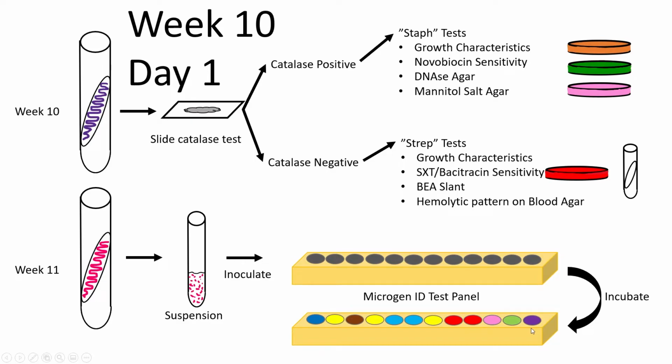We're going to talk more about that later, but this is an easy rapid test. It's still very common to this day, mostly because it has all the stuff that you need conveniently packaged for you rather than making hundreds and hundreds of tubes like we do. It's pre-manufactured, so it's very quick, a little on the pricey side. So don't spit in these or lick them, because that would be bad and ruin the tests. Also, don't drop them on the floor, because once they get contaminated, it screws up all the results, so don't do that.